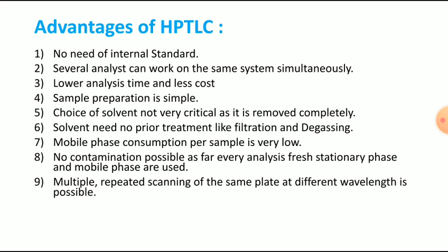And actually, HPTLC is an ideal technique because it is based on a different separation mechanism, usually normal phase in TLC, and the densitometric scanning of individual or all fractions can be repeated with the same or different parameters.